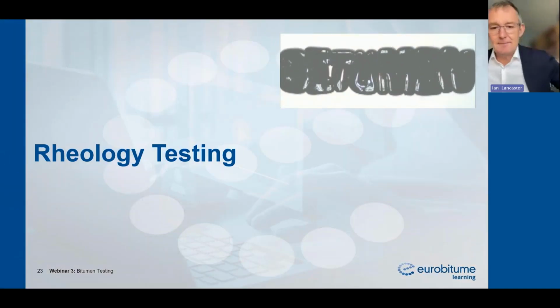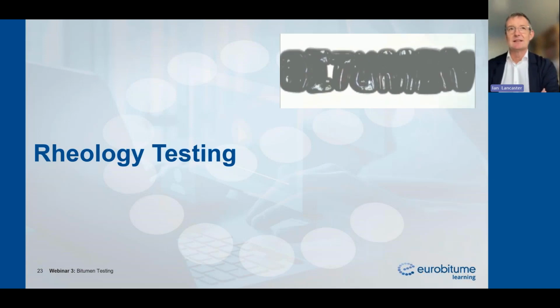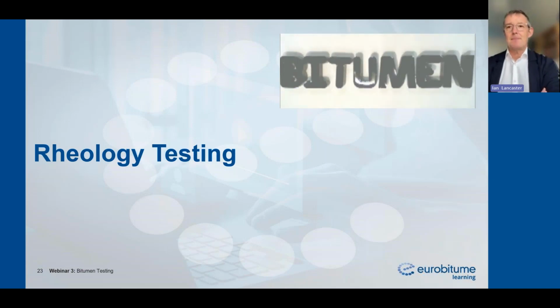We're now going to look at rheological testing. This is the state of the art for bitumen testing as we stand today. Now, I don't want anyone to be scared by rheology, because what it does is allow us to understand fundamentally what happens to the bitumen under the action of different stresses and different temperatures. And rheology tells us why glass shatters, why a rubber ball bounces, why water flows.